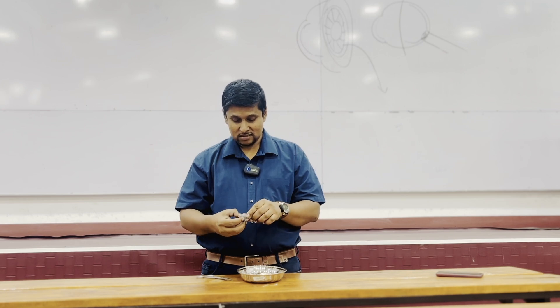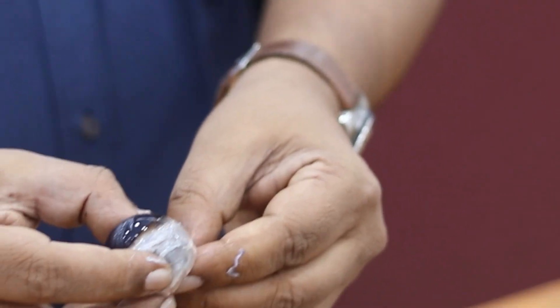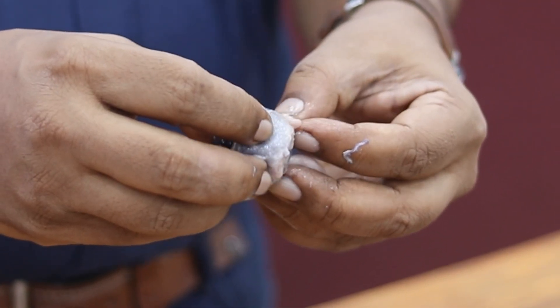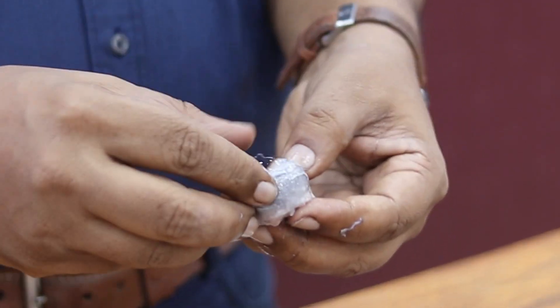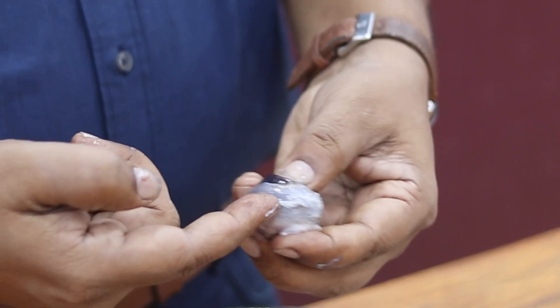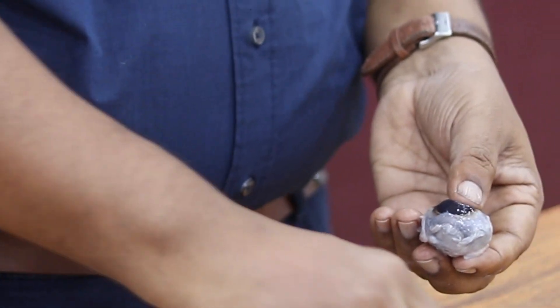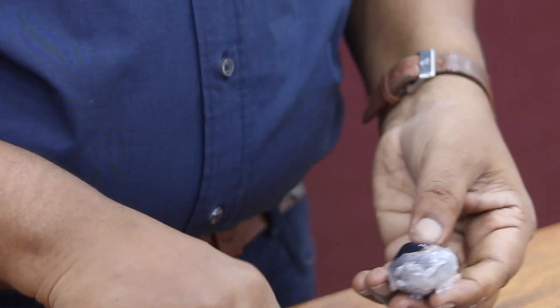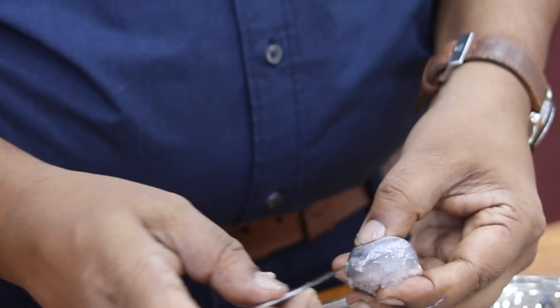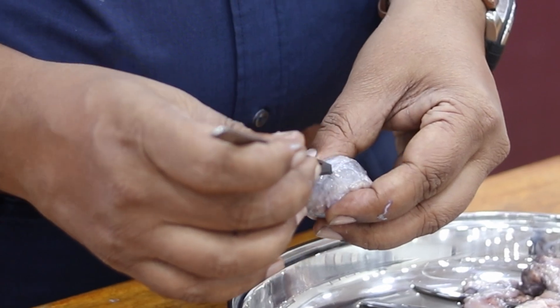You have learned the eye structure. Look at this — it's very soft, like a fluid-filled balloon, a very soft structure. This is a bit challenging to cut, so I'm going to cross-cut it in this plane and then open it and show it to you. I'm applying a little bit of pressure as I cut in this direction.